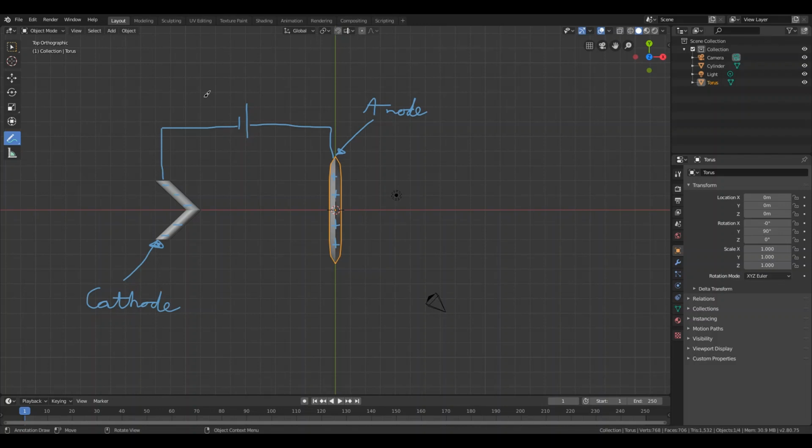So we are talking thousands of volts. 20,000 volts, that's totally not unrealistic. You could actually go up to like 50,000 volts, but I'm just gonna write 20.